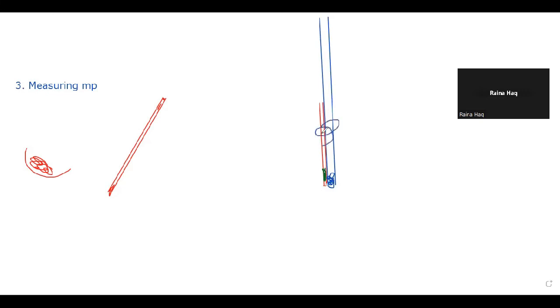So this is tight there. Even while tying this, it often breaks, and it cannot be tightened with rubber. Okay, this is ready. And then a beaker, take a small beaker with another liquid. I don't say solvent this time. You will see, a suitable liquid.